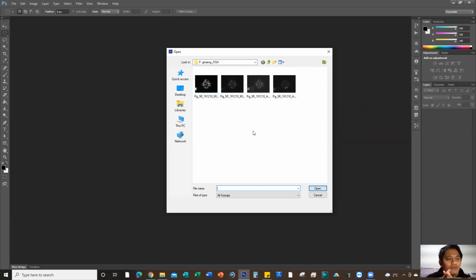So by the way, the objective of this video is first, how to overlay our fish data, each layer. The next one is how to enhance the image by contrasting the brightness and the darkness. Then last one is how to assign color, because we have standard color on how to put color in each signals, like the 5S, 45S, and telomere. So that would be the focus of this video.